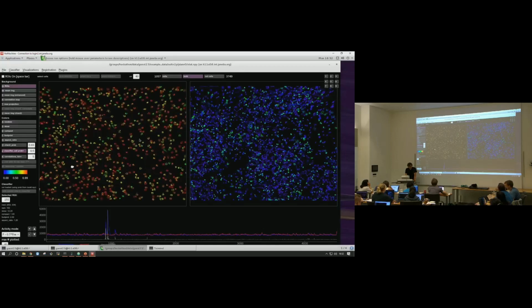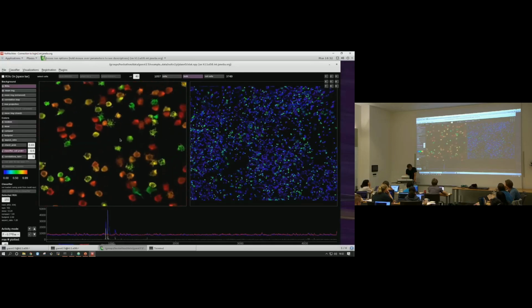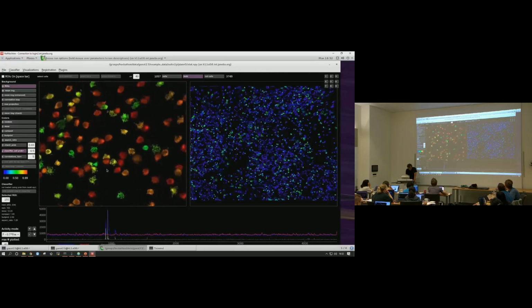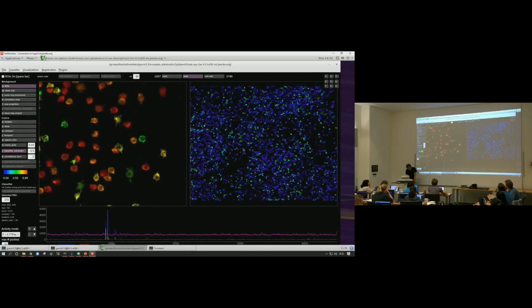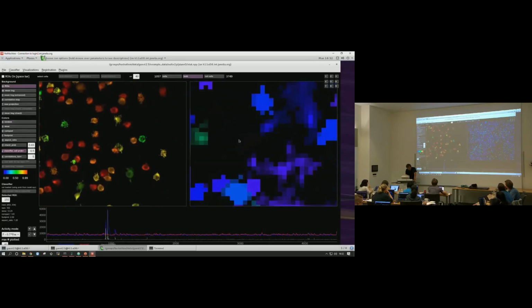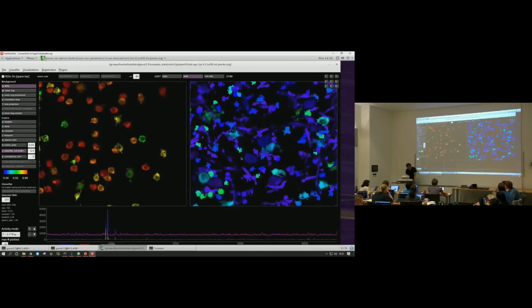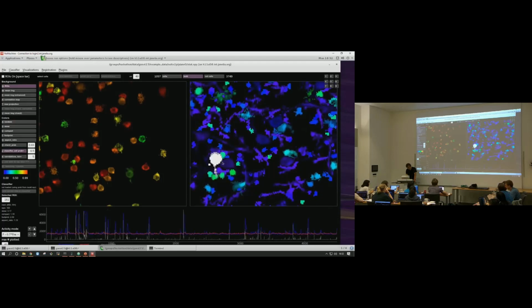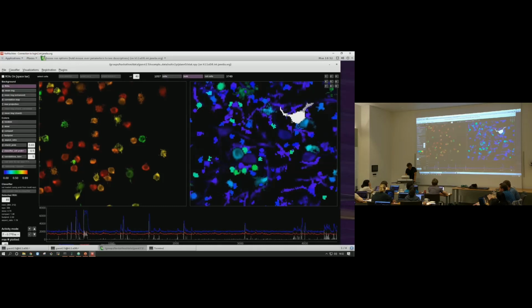Everything was moved. Now, if I had done a better job of labeling this manually, we would have gotten a sense of whether it improved or not, but at this stage we probably can't. But that's basically the workflow. So that's what I wanted to show you. And there are still, so here, these guys, which are some of our best cells, they were still misclassified. So that again has to do with these little processes coming out of them. So hopefully during this workshop we'll improve the classification of those. But that's a known issue.